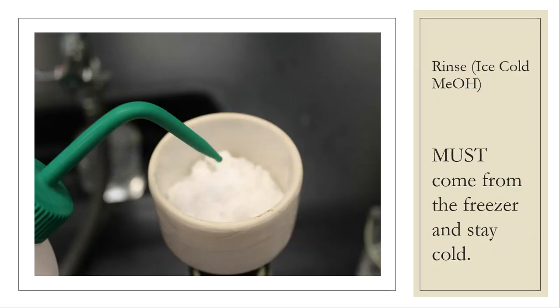And then I'm going to rinse those with ice cold methanol, and that's what you're seeing here in this picture. And it has to come from the freezer, right? Refrigerated is not ice cold. Refrigerated is refrigerated. Refrigerated is not ice cold. So the reason they say ice cold is because alcohols normally do not freeze. So if you ever put ethanol, aka drinking alcohol, in the freezer, you're going to see that unless it has tons of sugar and other additives, that alcohol is going to get super, super cold, but it's going to stay as a liquid. And methanol does the same thing.